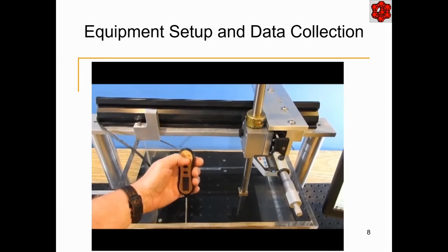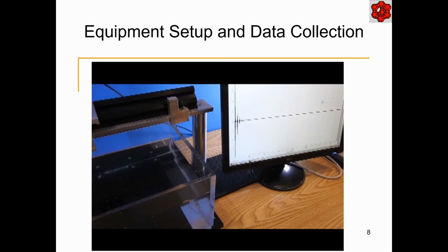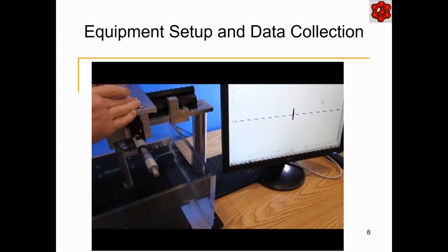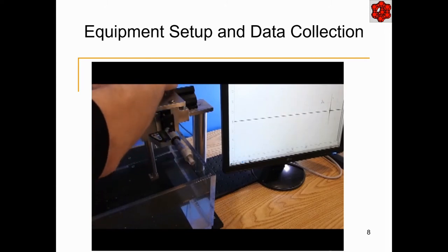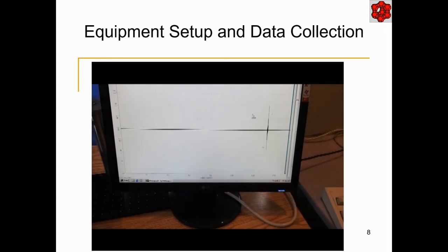Once the water is added to well above the probes and we can see no air bubbles trapped on any surfaces of interest, we measure the water temperature. With our data acquisition system on and the transmitter and receiver probes connected to the instrument, we can now see an A-scan display signal. We next pull the receiver probe away from the transmitter until we are at our working distance. This should leave sufficient space between the probes for us to eventually place the sample between them without having the sample in the near field of the transmitter. The range should now be reduced to about 10 microseconds, and we can make fine adjustments to optimize the probe position by making small adjustments to the vertical position, offset, and skew while monitoring the A-scan display to maximize the response.